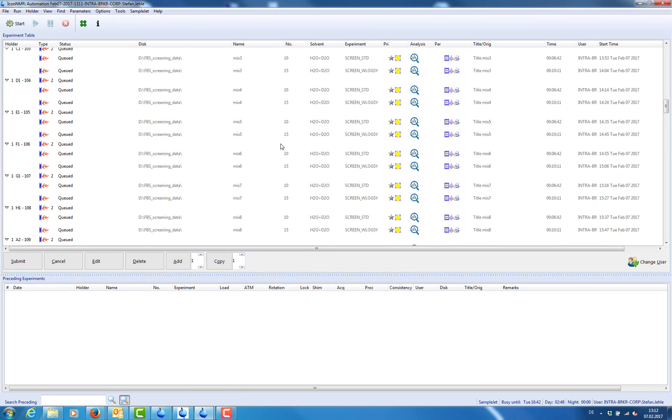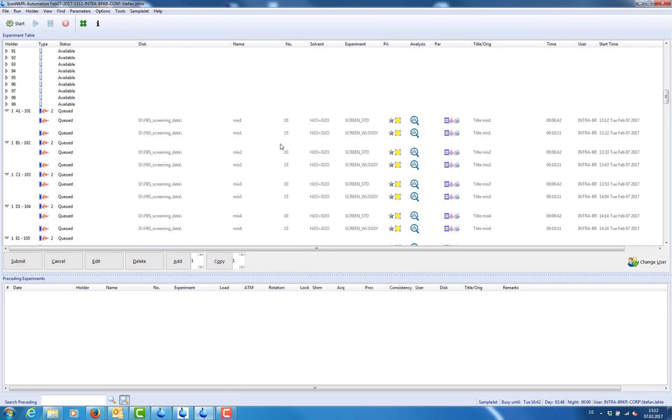After importing the Excel spreadsheet, we can check if all information has been imported correctly and assigned to the right holder position. This is the dataset storage location, this is the dataset and the experiment number, and this is the experiment type.